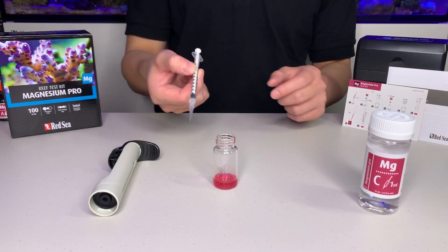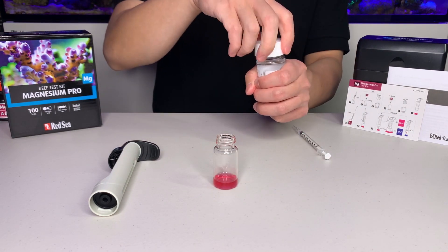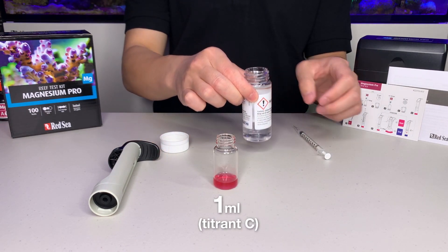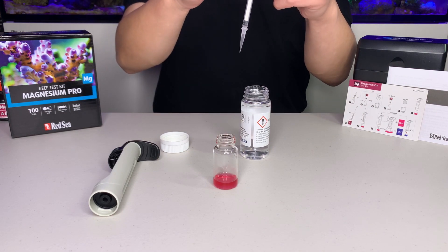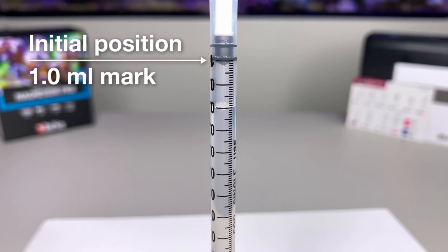We are now going to prepare the titration. Use the 1ml syringe provided to take 1ml of titrant C. Make sure the bottom of the plunger is at the 1ml mark. Here's a close up so you can see where the plunger should be sitting.